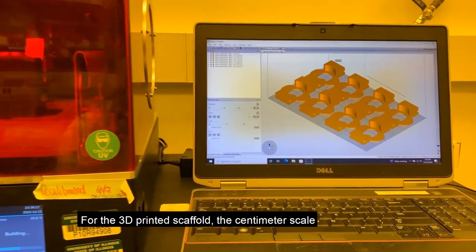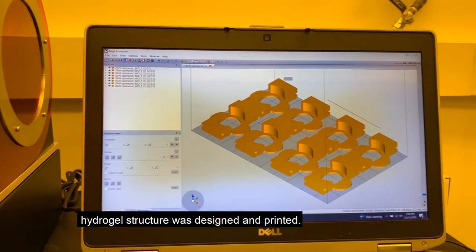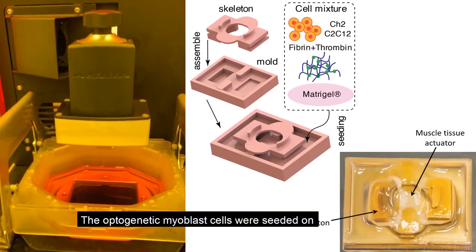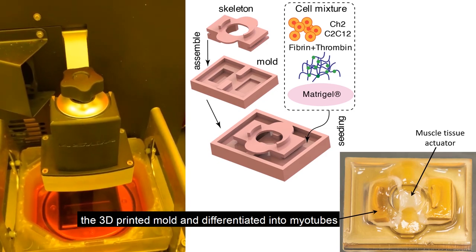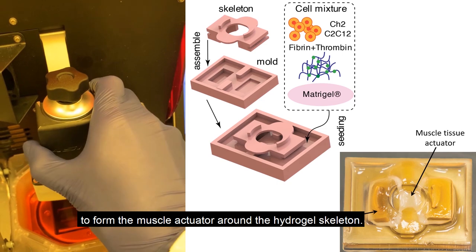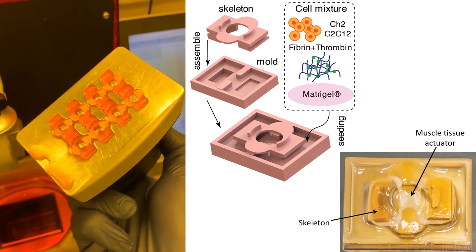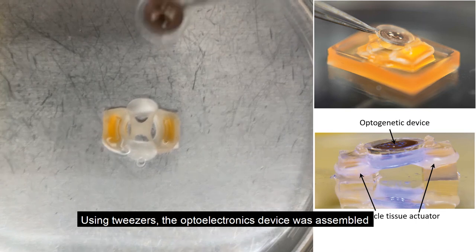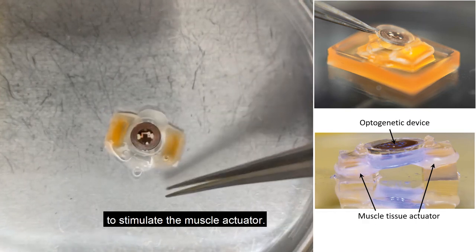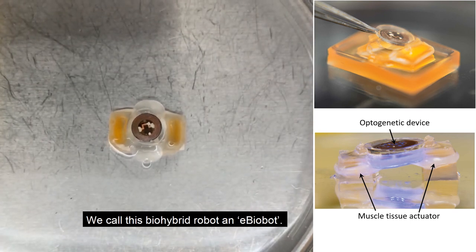For the 3D-printed scaffold, the centimeter-scale hydrogel structure was designed and printed. The optogenetic myoblast cells were seeded on the 3D-printed mold and differentiated into myotubes to form the muscle actuator around the hydrogel skeleton. Using tweezers, the optoelectronic device was assembled onto the skeleton to stimulate the muscle actuator. We call this biohybrid robot an e-biobot.